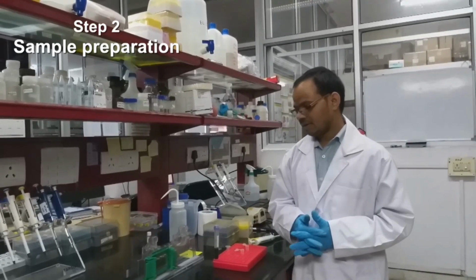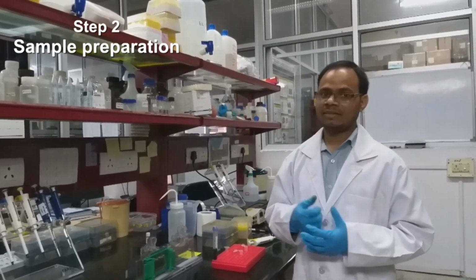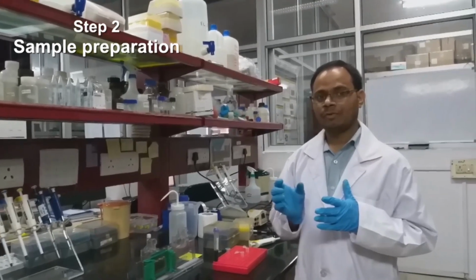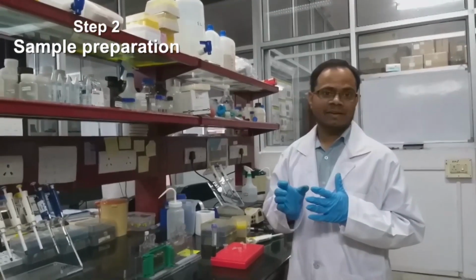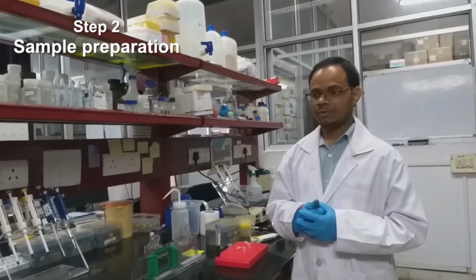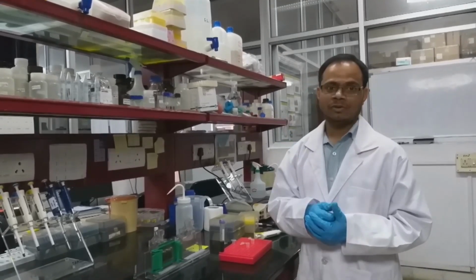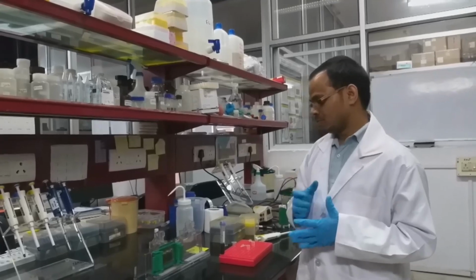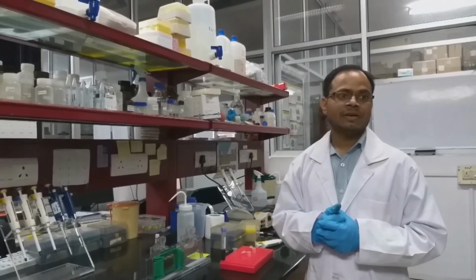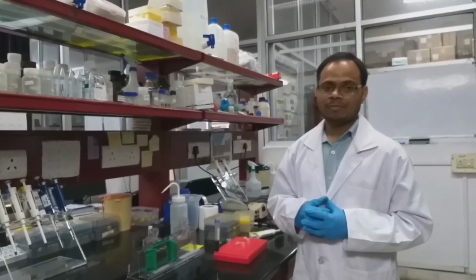The other thing is glycerol. While loading the gel, since the protein solution is not that dense, it may come out from the well. So in order to prevent this, we have to load with a denser solution like glycerol. So 30 to 50% glycerol is sufficient for keeping the protein solution intact at the bottom of the well. The other thing, bromophenol blue, we use just for tracking how much the gel has completed. So this is the loading dye.